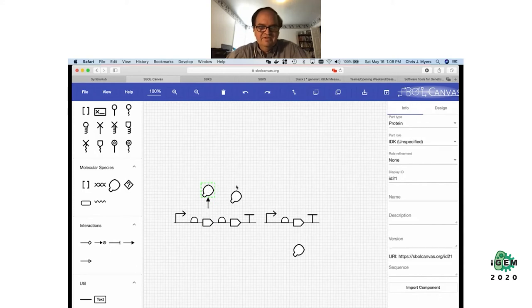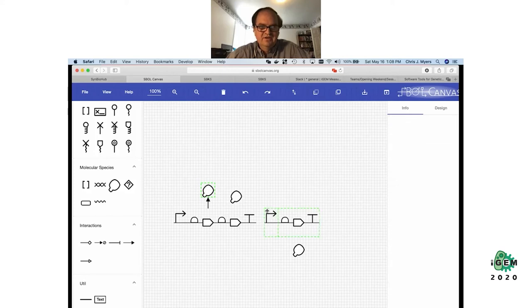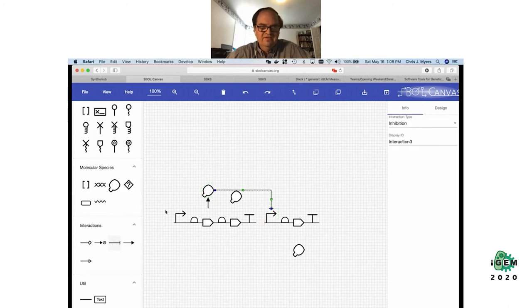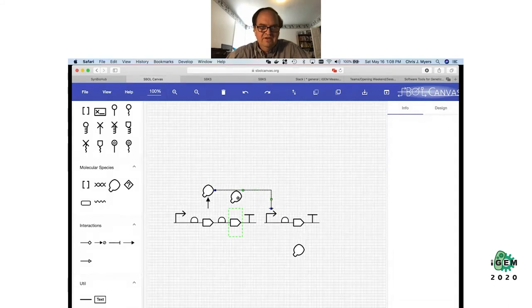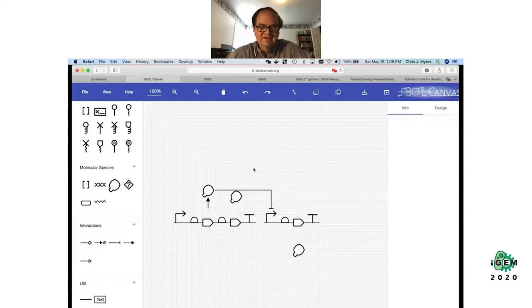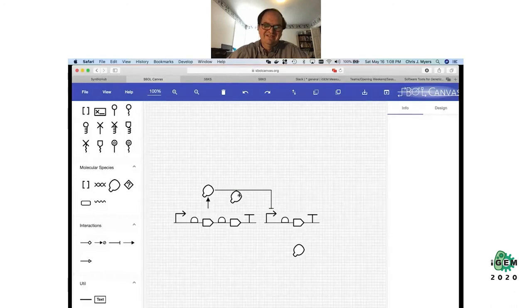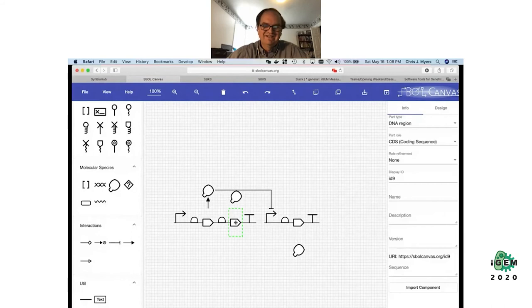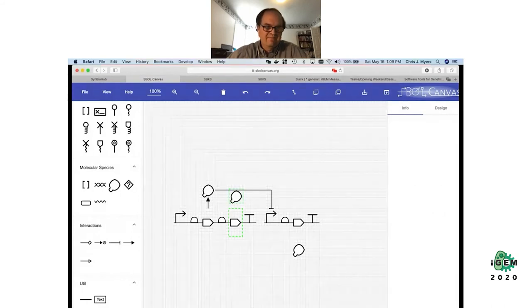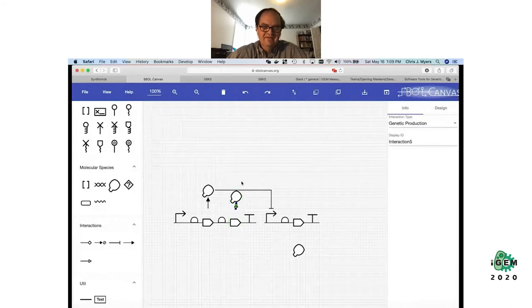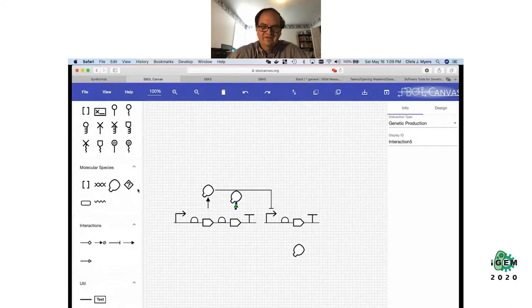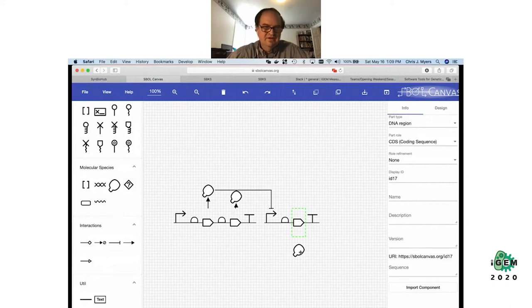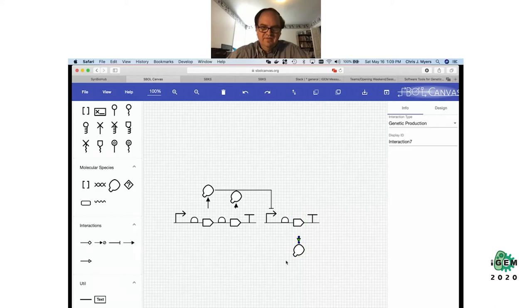And then I want to say that this protein represses this promoter. This coding sequence codes for GFP, and this other protein represses that other promoter. Now maybe we might want to make it look a little bit prettier — I can start with this gene, apply a fill color, so this coding sequence I'll use this color.